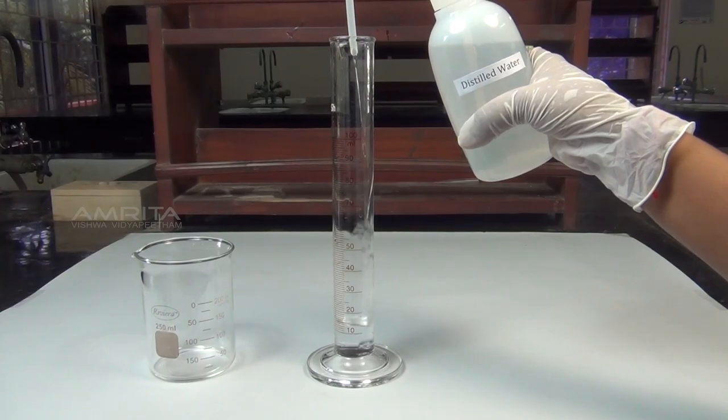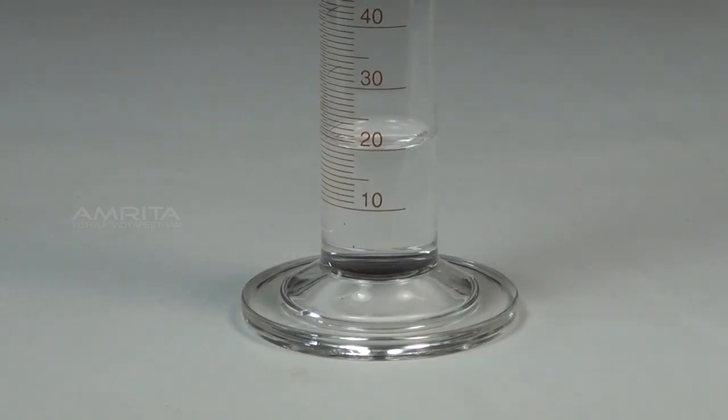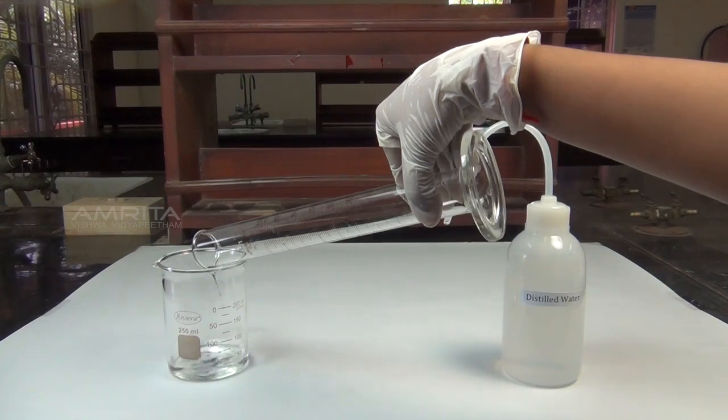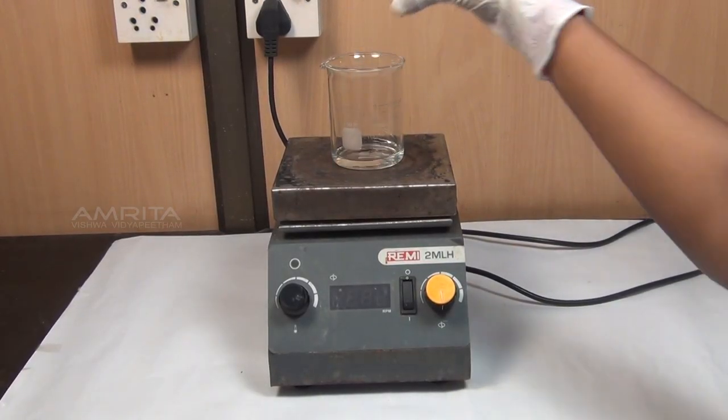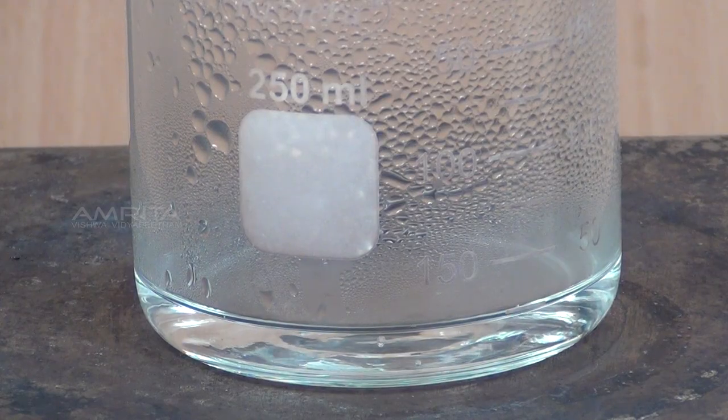Now measure about 20ml of distilled water in another measuring jar. Transfer it into another 250ml beaker. Boil the water in the beaker for about 5 minutes over the hot plate to expel the dissolved air.